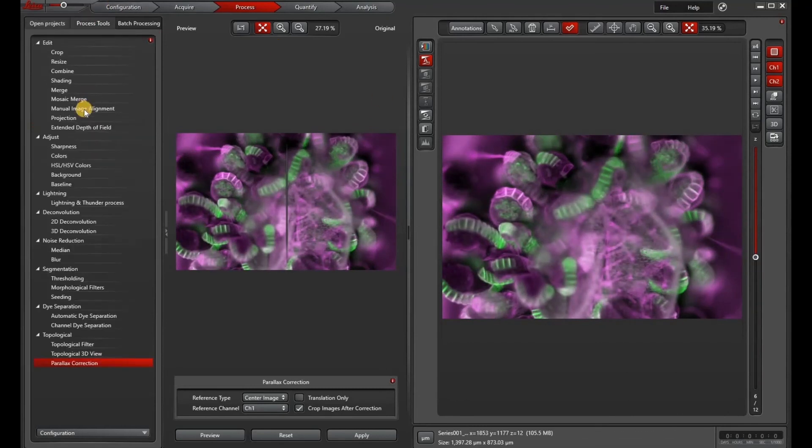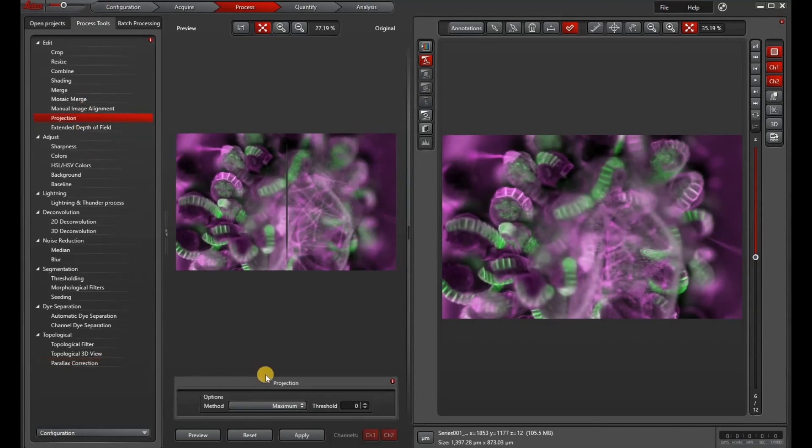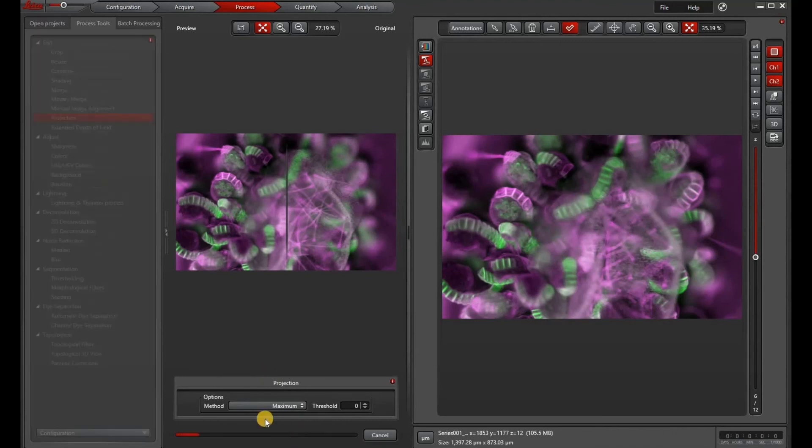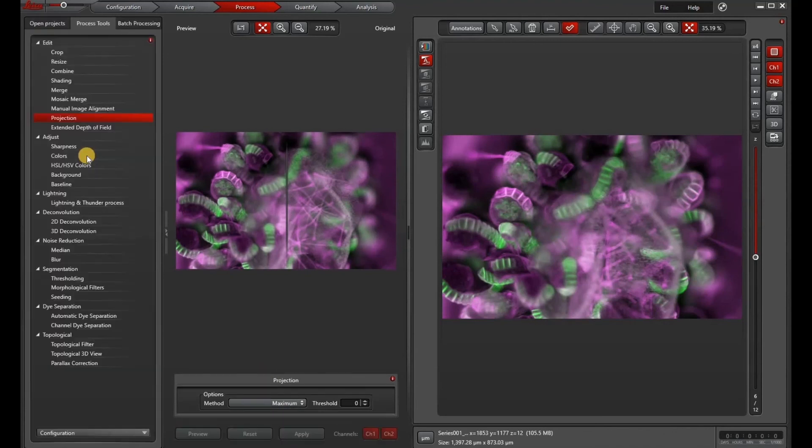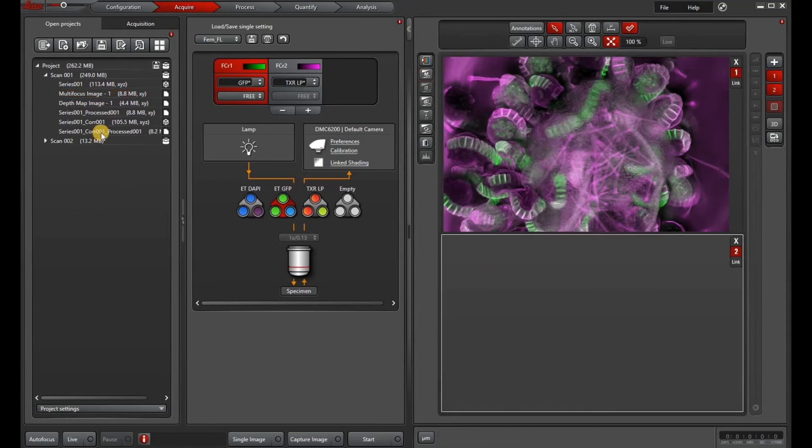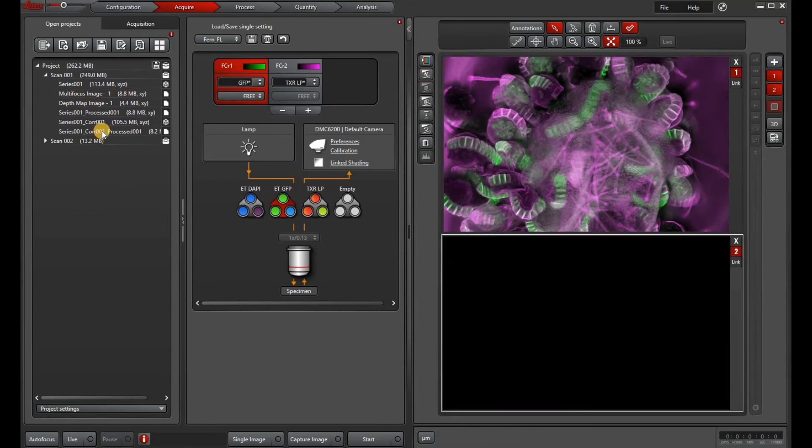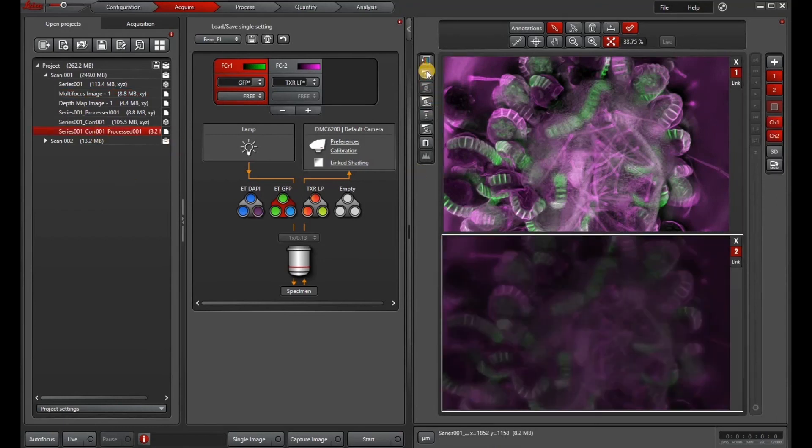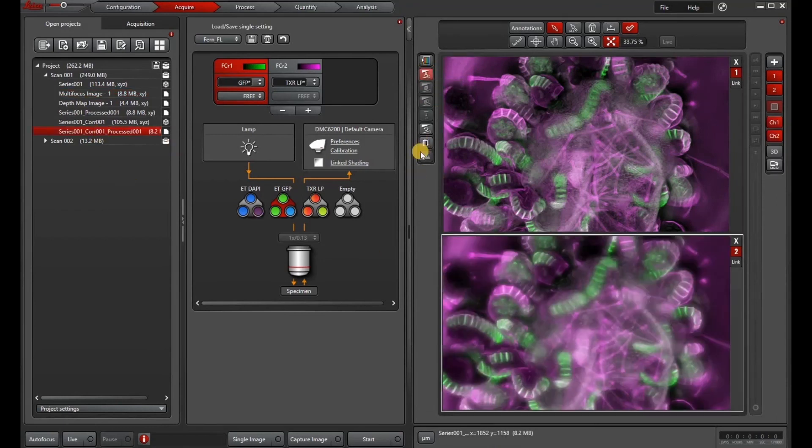Then go under process tools, select projection. There's a variety of different projections. I chose maximum intensity projection and that will appear as the processed image here.